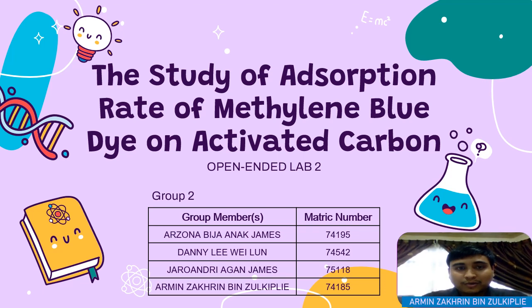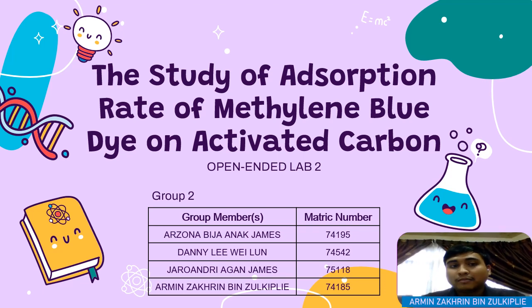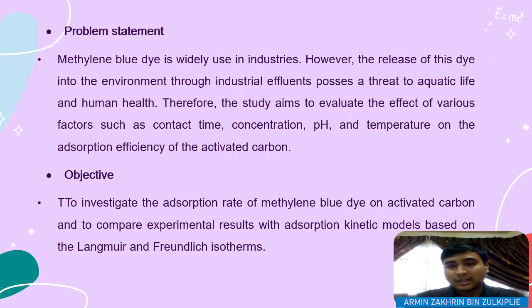Today we present open-ended lab 2, which is the study of the adsorption rate of methylene blue dye on activated carbon. My part is from the introduction to the problem statement, objective, and variables. For this slide, I will explain the problem statement and objective.